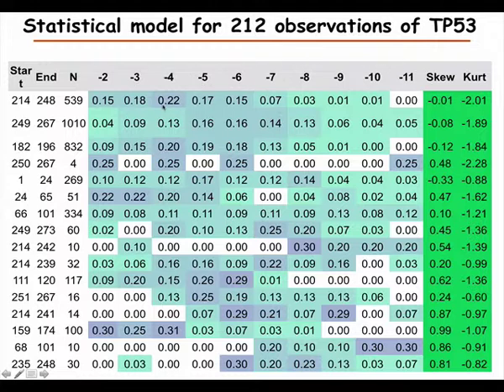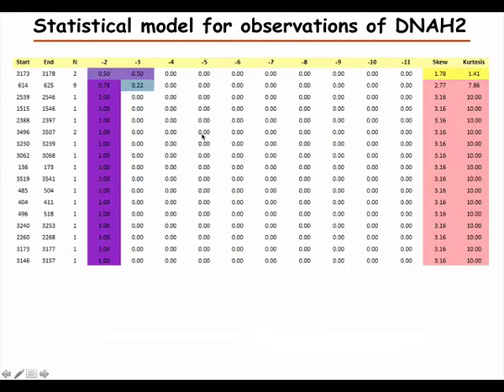What we can see is that these are, of course, all very good hits. What we usually observe is quite a big negative kurtosis, and the distributions are usually skewed, and we also have many observations over a wide range.